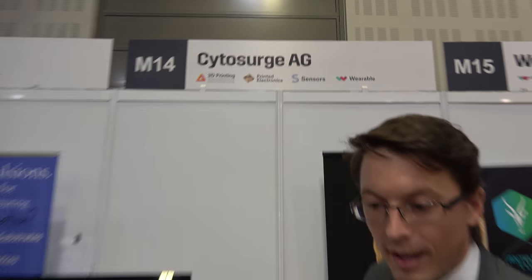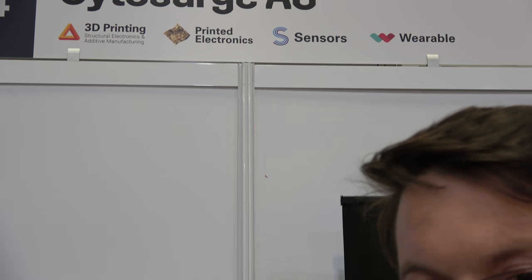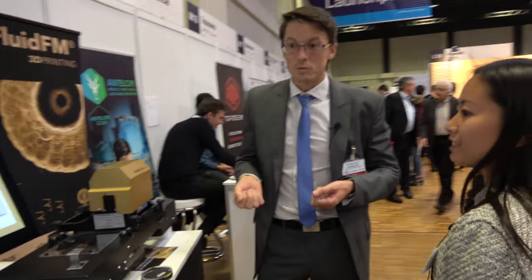It's not only 3D printing or not only sensors, and this helps a lot. We had very good conversations. We had until now seven or eight different application ideas which we didn't expect. So let's see what comes up afterwards, but it was a great start.